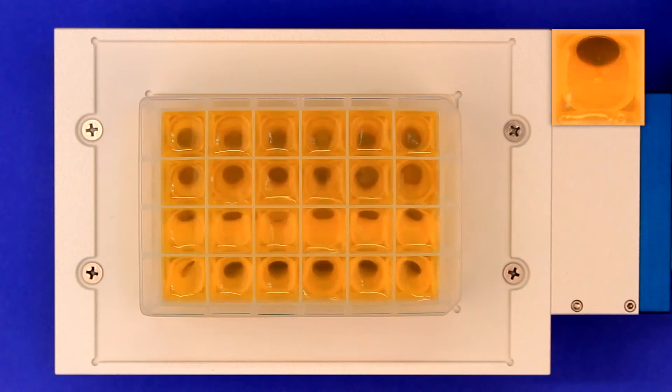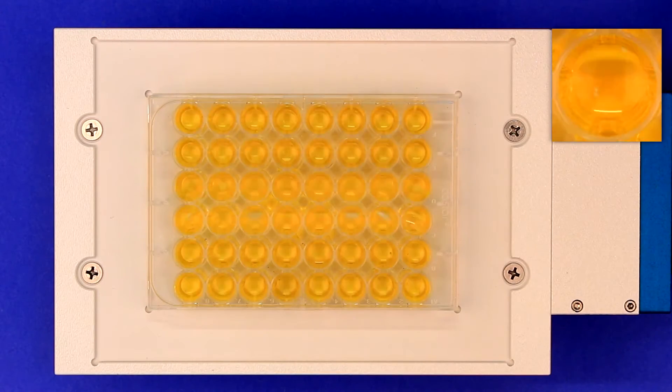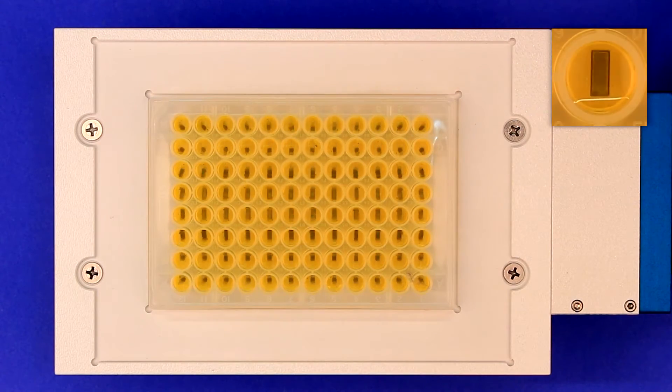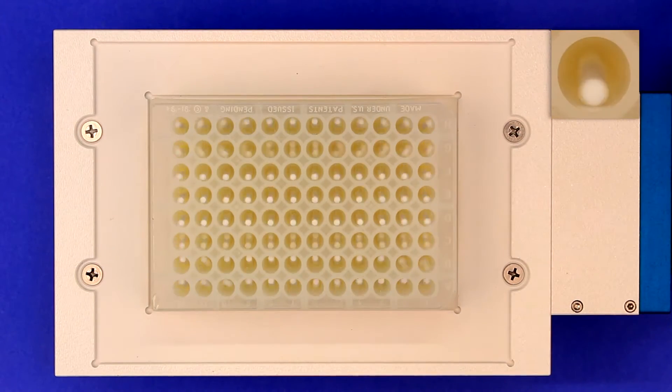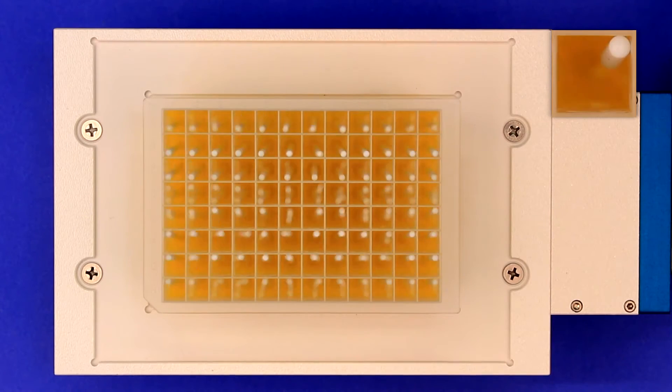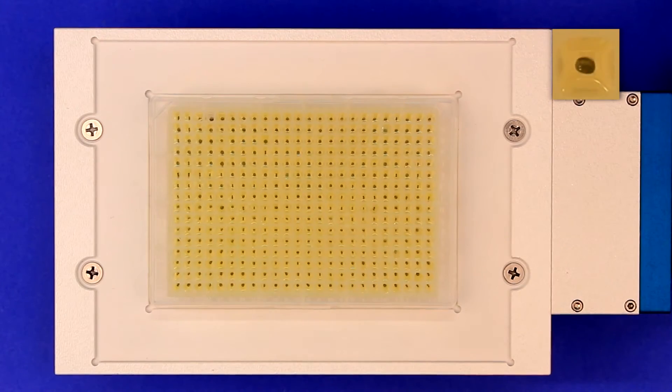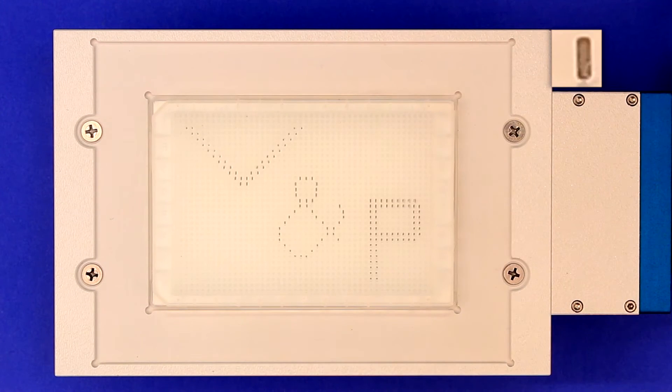You can see the tumbling action of our stirrer. A close-up view in the right-hand corner shows the unique motion of our stirrer elements. You can see that any well shape or format is compatible, even in 1536 microplates.